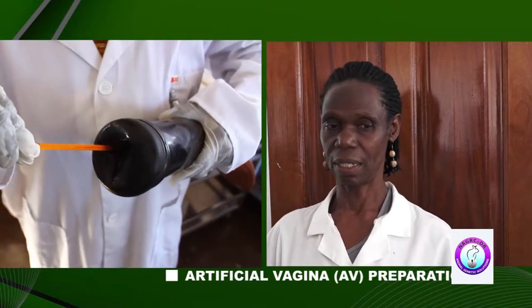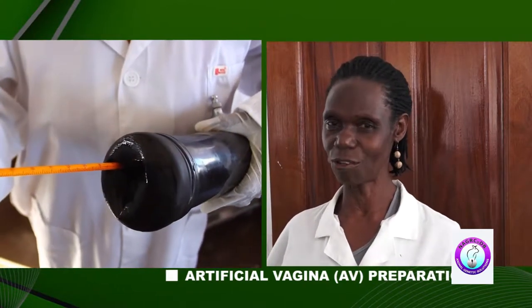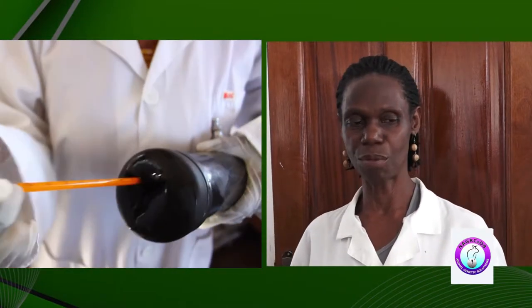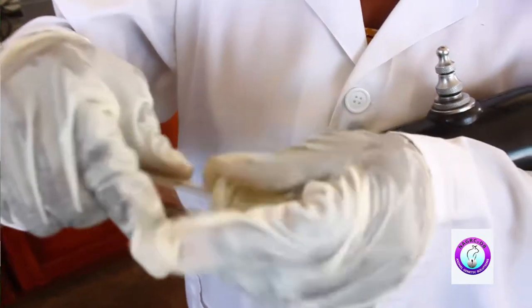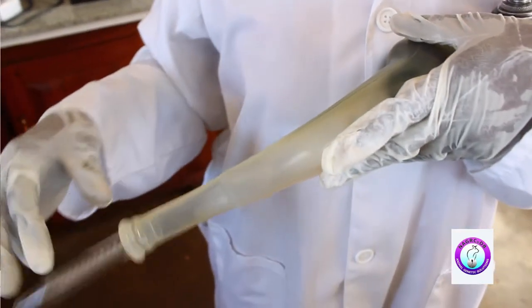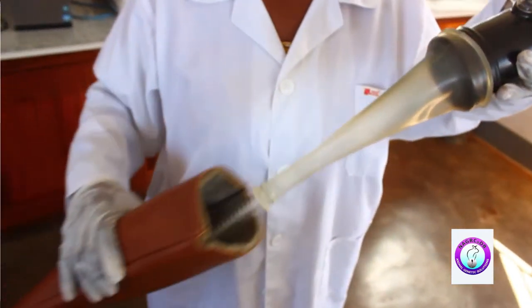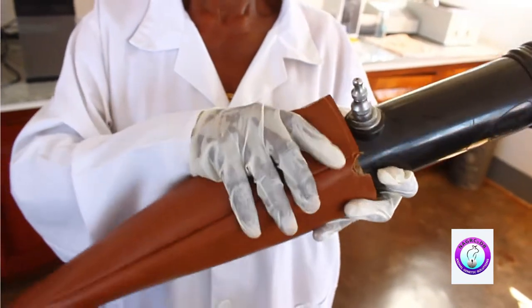And after which, we put in a thermometer to measure exactly what temperature we are going with to the bull. We prefer putting 50 degrees centigrade. By the time we go for collection, it will have stabilized to the right temperature. The tube is for us to collect semen from the bull, to cover the semen. So this would represent an already prepared AV.